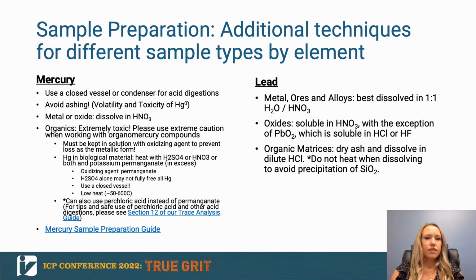And this slide just gives the sample preparation methods for mercury and lead samples. Again, I'm not going to go into detail on these, but I did want to include these here so that you can refer back if need be.